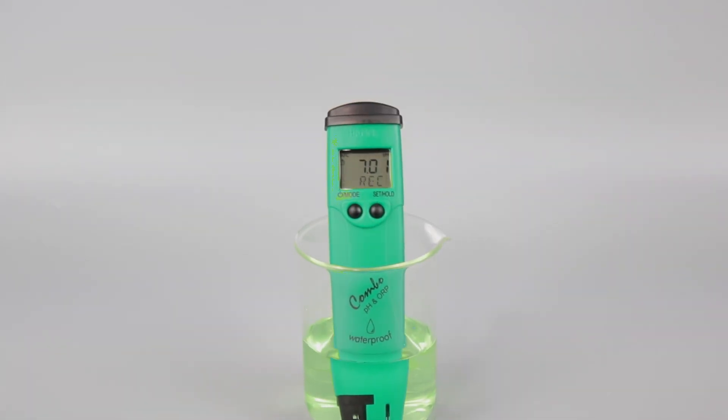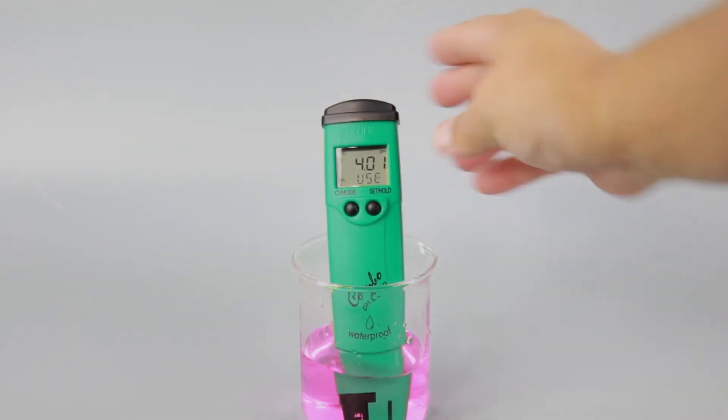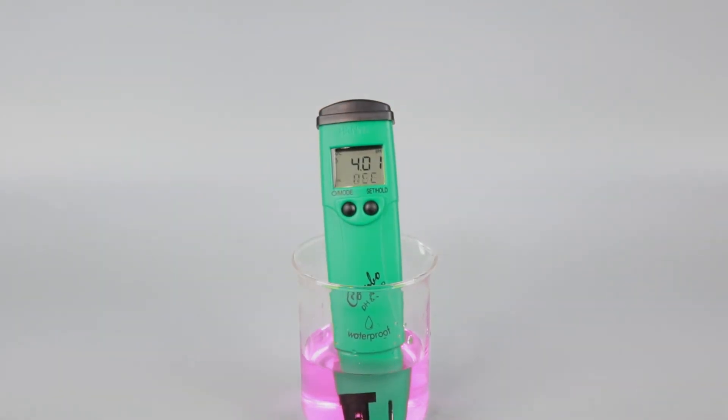Once recognized, it will ask you for the next buffer. After it's complete, the meter will automatically return to measurement mode.